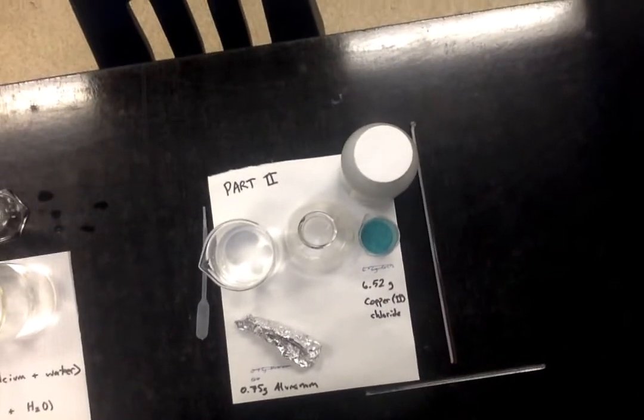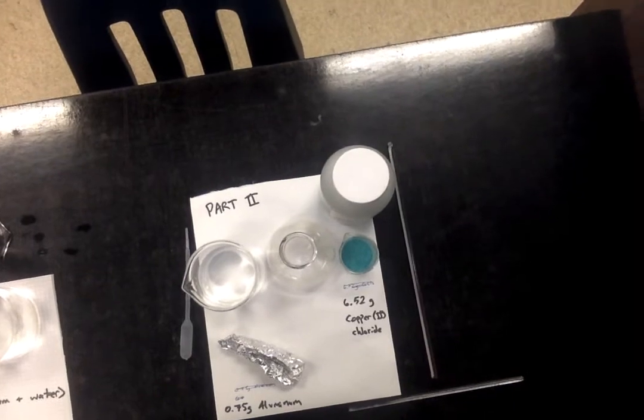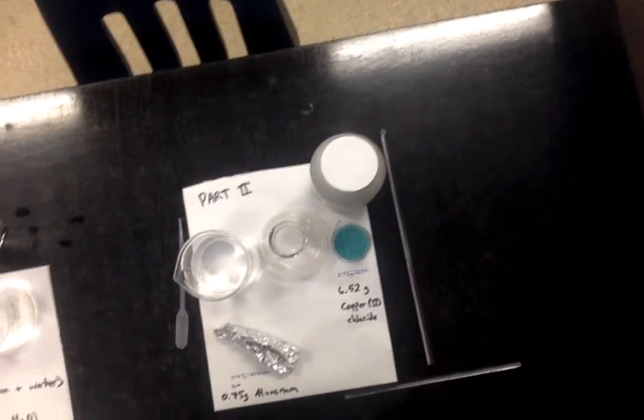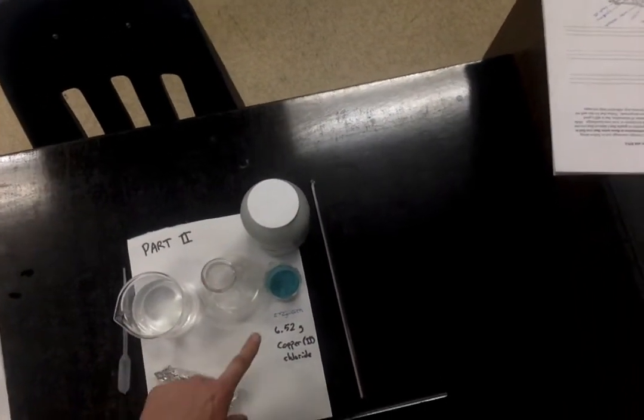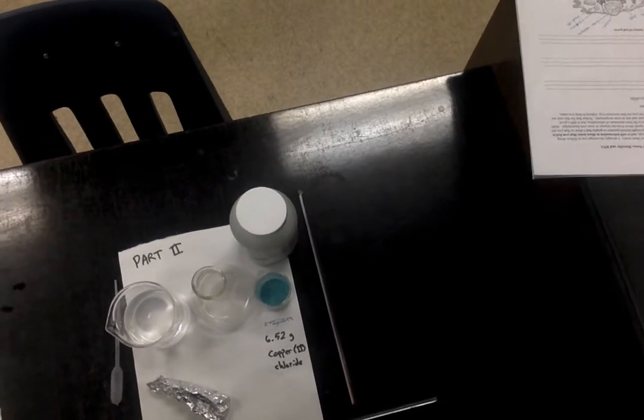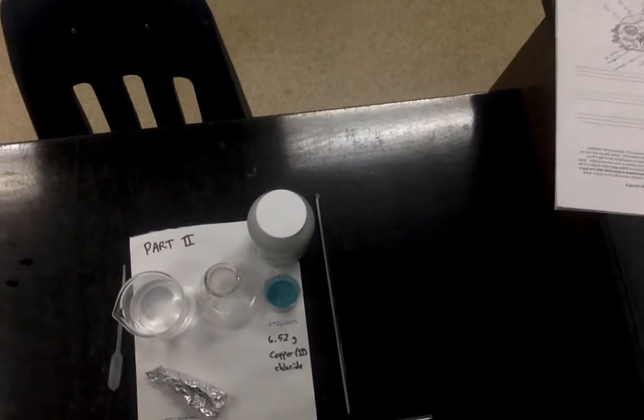The other things you might have noticed about it is you might want to go back and pause the video and make some observations about what the calcium looks like. That might be qualitative. Let's get these on. For part 2, as you can see, I hope, I have the following: 150 milliliters of water, an Erlenmeyer flask. I've got 6.52 grams of copper chloride, and I'll show you that more up close in a moment, and 0.75 grams of aluminum foil.